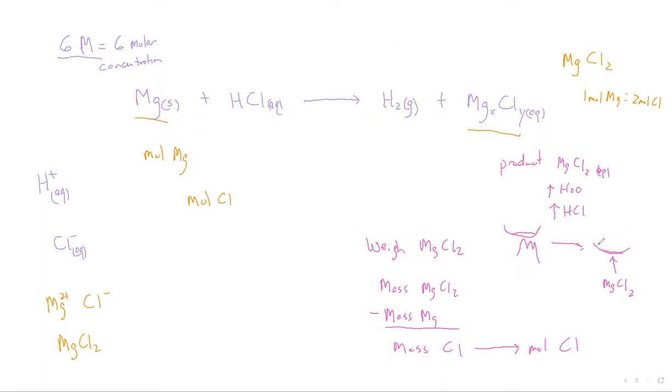In this evaporation stage, the magnesium chloride has the potential to sublime. So if we overheat it, this magnesium chloride can sublime. What does it mean to sublime? It means it'll go directly from magnesium chloride solid to magnesium chloride vapor. And then we lose it. So there's a potential if we overheat this.